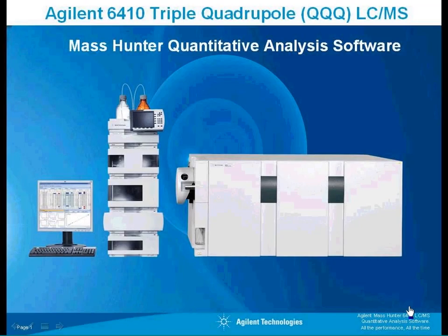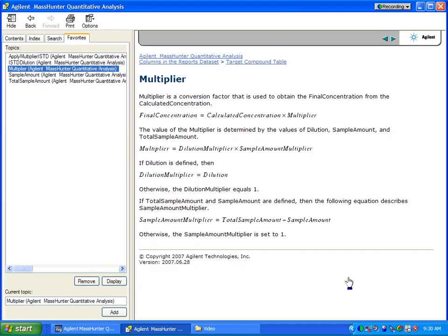Let me discuss several sample-oriented settings that can affect your final concentration. That will include a set that are related to the multiplier, and then I'll spend time explaining the ISTDdilution setting, the concept of the multiplier.